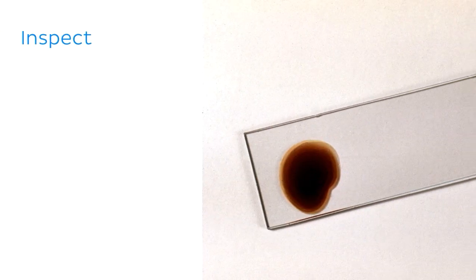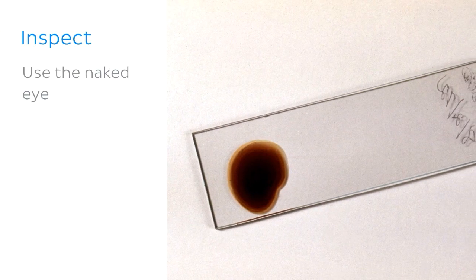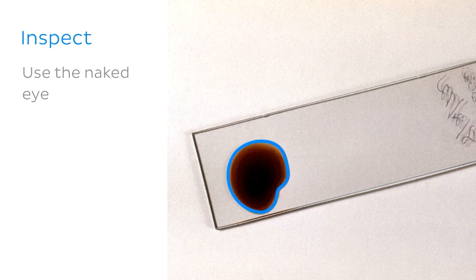So let's begin with the first step. Before you put your slide under the microscope, use the naked eye to determine the shape of your preparation. This might seem a little trivial, but looking at the slide before you put it under the microscope will help you orient yourself when you do eventually look at the slide under the scope.